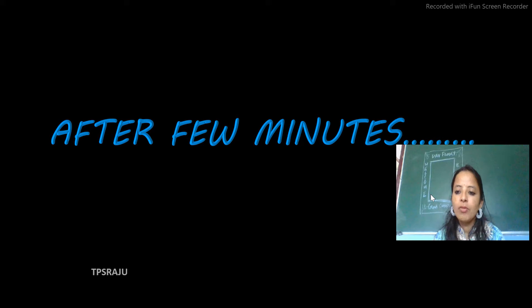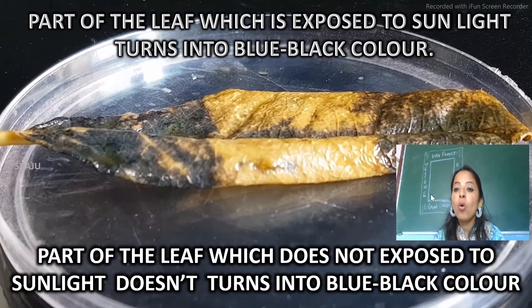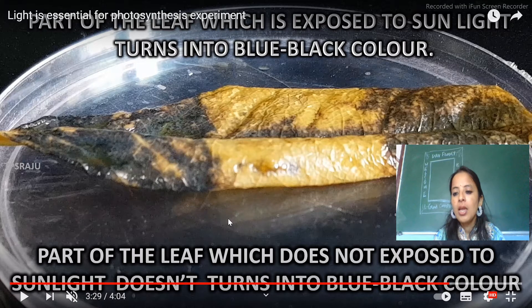After a few minutes, what we will observe is that the part of the leaf which was exposed to sunlight turns into blue-black color, whereas the part of the leaf which was not exposed to light does not turn into blue-black color. It shows that starch has been formed only in that portion of the leaf which was exposed to sun rays, and does not form in that which was covered with the paper.